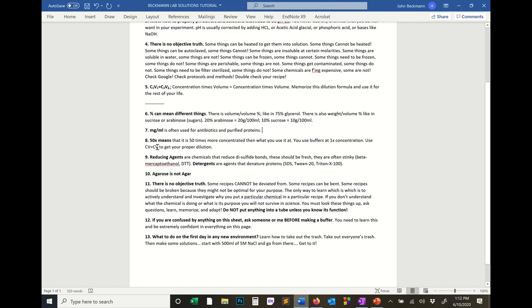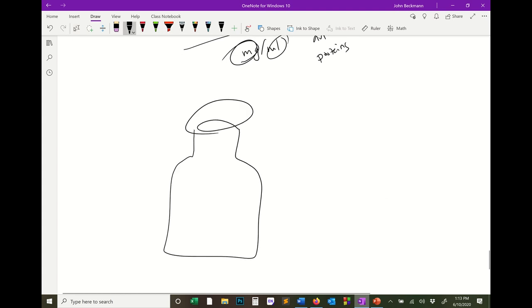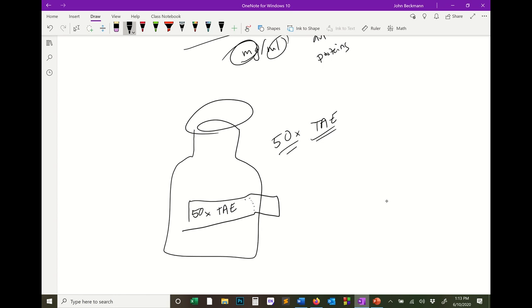Okay, this is pretty obvious, but another common thing you'll see in the lab is you'll see this signature 50x, okay? So what I mean by that is you might see a bottle, and on that bottle there is a nice tape with a nice flap, and it might say 50x TAE, okay? So this is a solution of TAE. But it's not just TAE, it's a solution of 50x. And that 50x means it's 50 times concentrated beyond what you would use it at, okay?